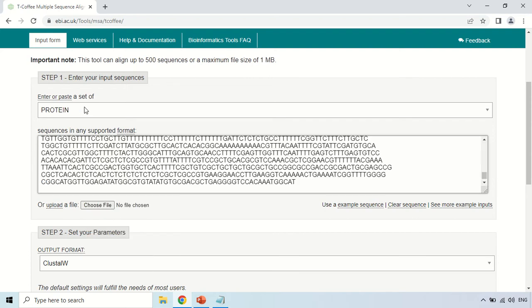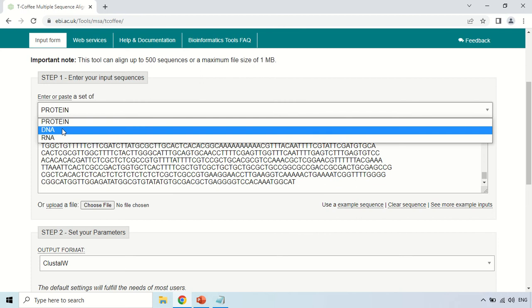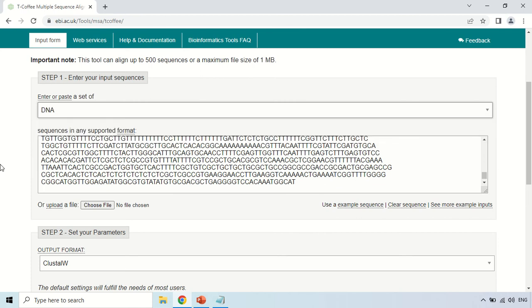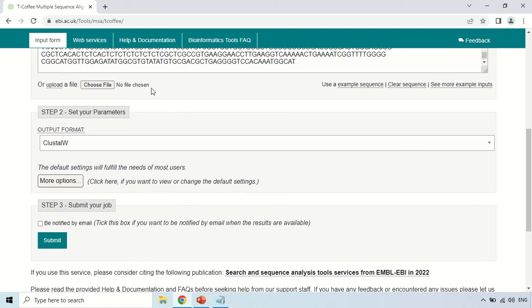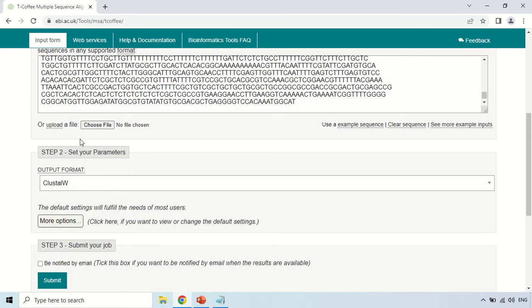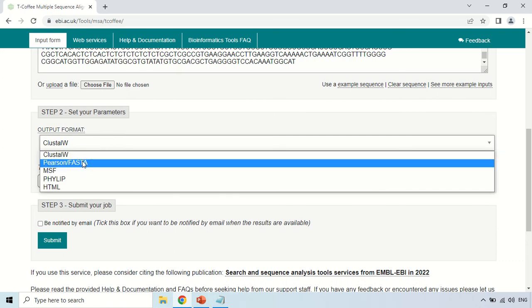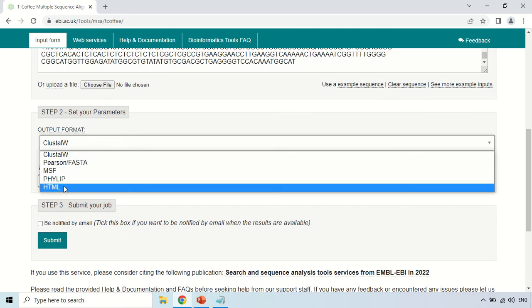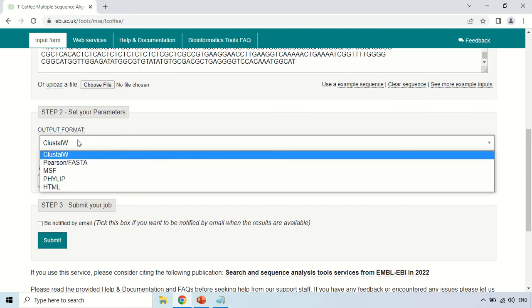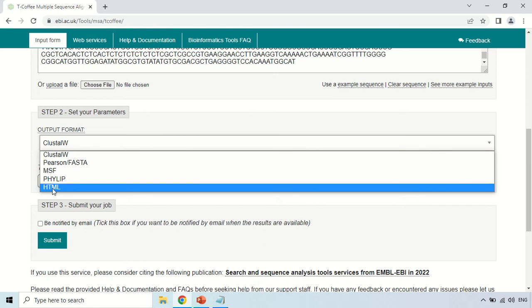Now, enter and paste a set of sequences. Here you have to choose whether the sequences you are aligning are protein sequences or nucleotide sequences. As these are nucleotide sequences, I am choosing DNA. You can also choose a file to upload. In the output format section, you can choose the format you want for your results: ClustalW, Pearson or FASTA, MSF, FileLip, or HTML. For this instance, I am clicking HTML format.